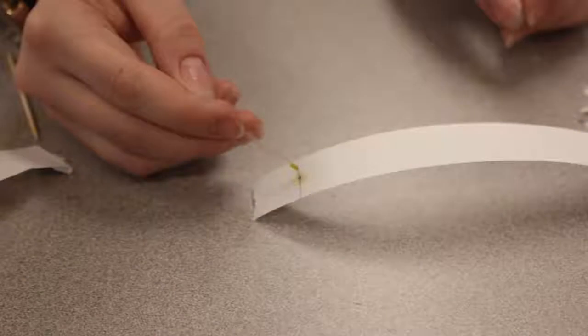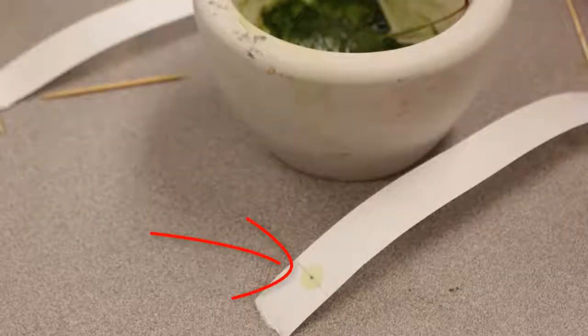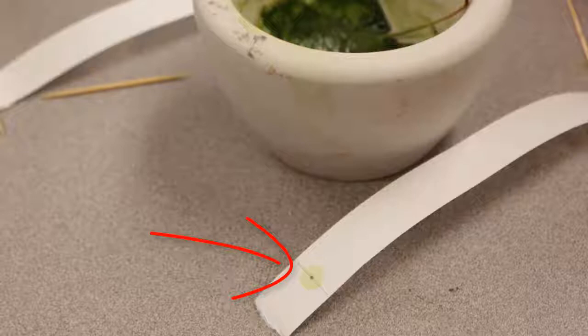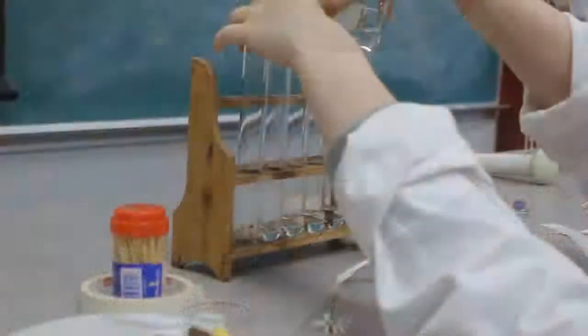Using a capillary tube, dab a dot of your mixture onto the pencil dot that we marked on the paper earlier. Letting it dry between each application, continue dotting on the same spot until you have a highly concentrated spot of pigment on your paper. Here you can see a lightly pigmented spot on the paper. Try and dab it a few more times so that it's darker and more concentrated.